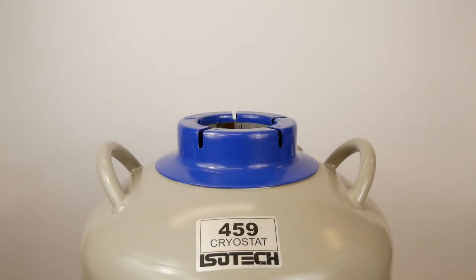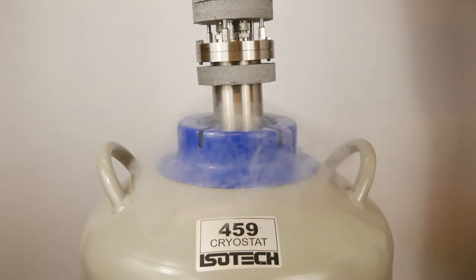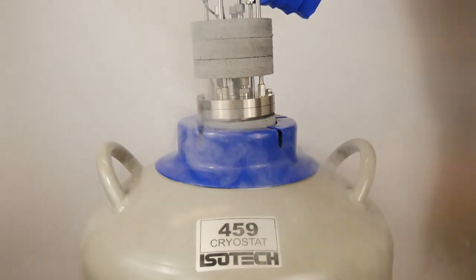Now we're placing the cryostat assembly into the flask of liquid nitrogen. Liquid nitrogen is going to cool the block down in temperature towards the liquid nitrogen temperature.